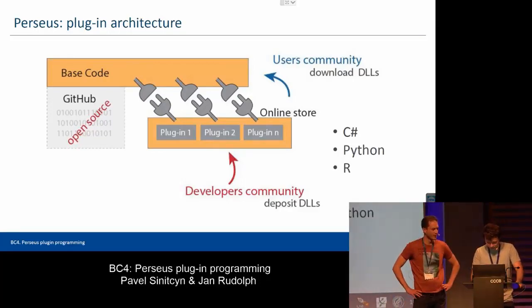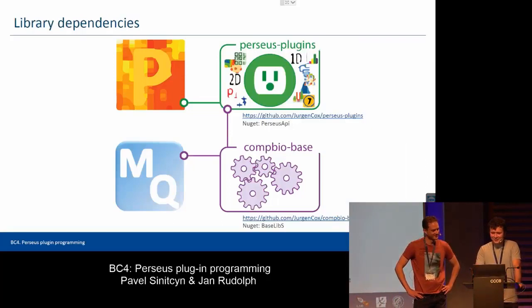I really want to program some plugins, man. Oh my God, okay. One small thing.